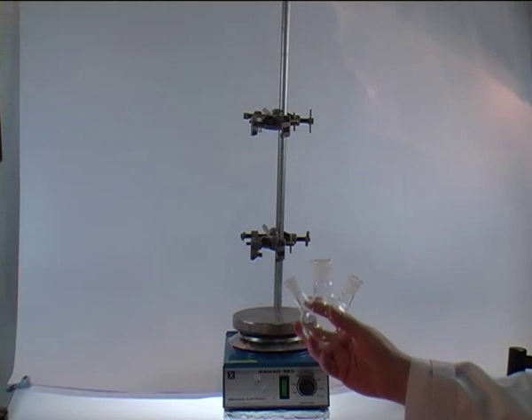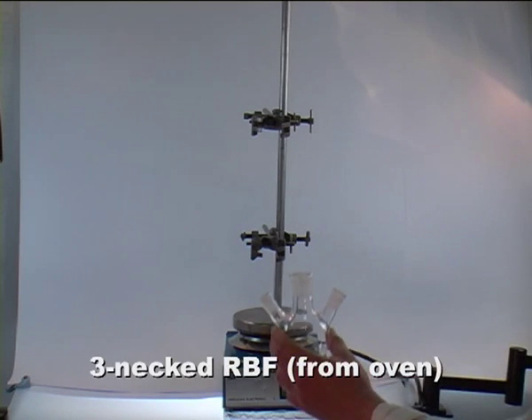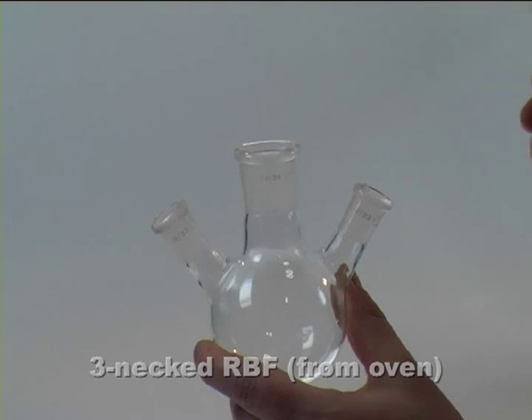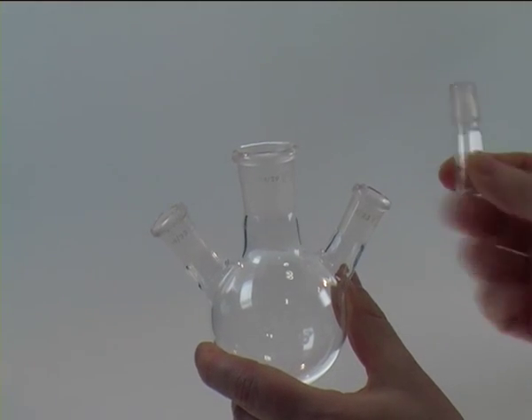Next we are going to take the three necked round bottom flask out of the oven so that it is dry. Before it is cooling down, we are going to stopper one of the three necks.